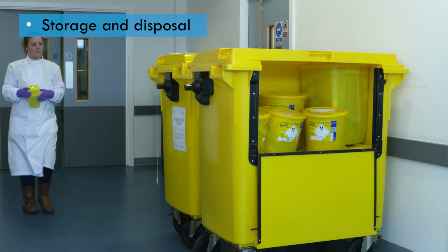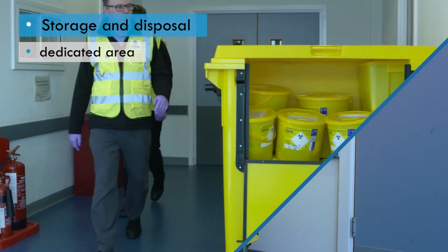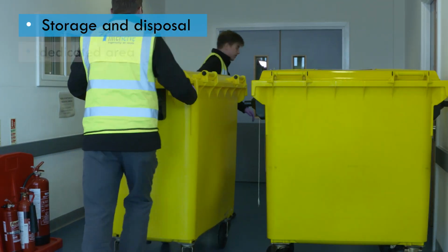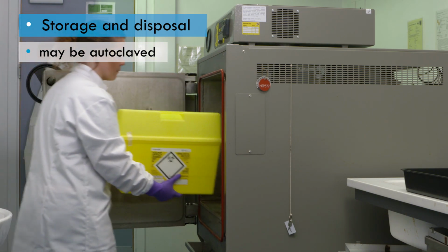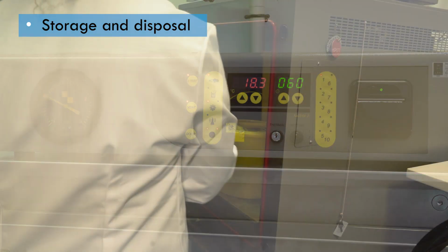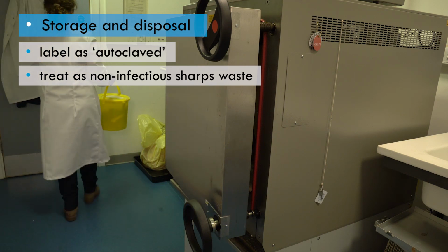Where sharps bins are being stored before collection by a specialist sharps disposal service provider, or before on-site incineration, they should be placed in a dedicated collection area. Where sharps bins are being autoclaved, appropriate temperature, pressure and duration should be used to ensure decontamination. After autoclaving, the sharps bins should be labelled as autoclaved. They can then be disposed of as normal sharps waste. They no longer need to be treated as infectious sharps waste.